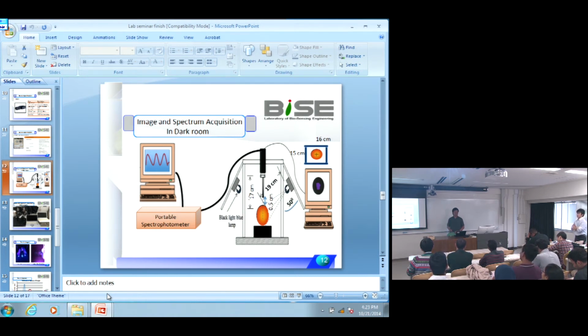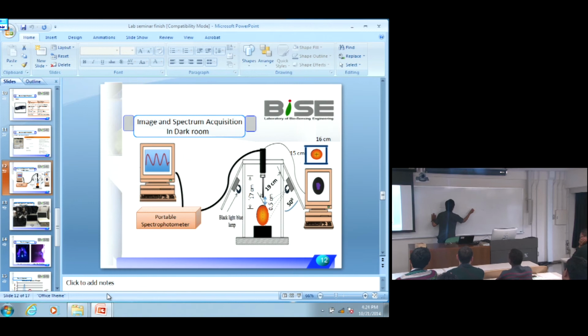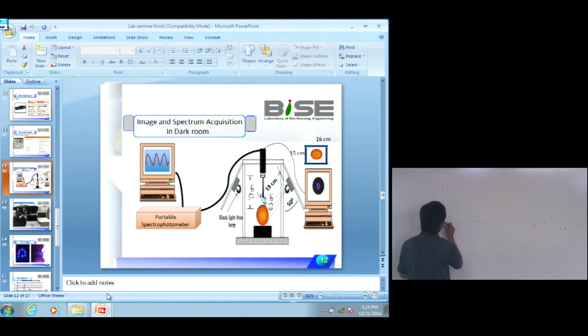You use 350 nanometer light. 360 or 350 nanometer. I use UV radiant light. This light can give us an emitting wavelength between 300 and 400 nanometer. Can you explain the fluorescence emission or excitation spectra? What is the region? The most of the fluorescence substance, excitation spectra region. Like this. What the sensor?